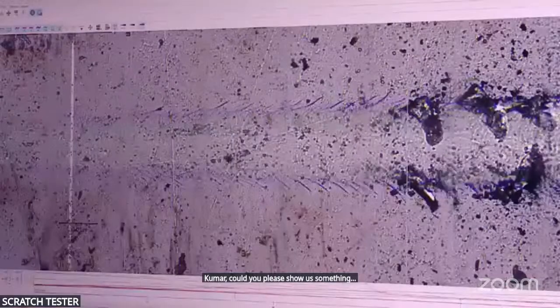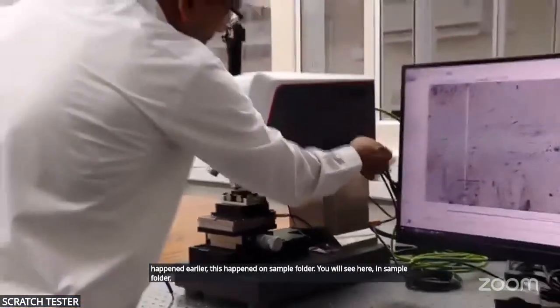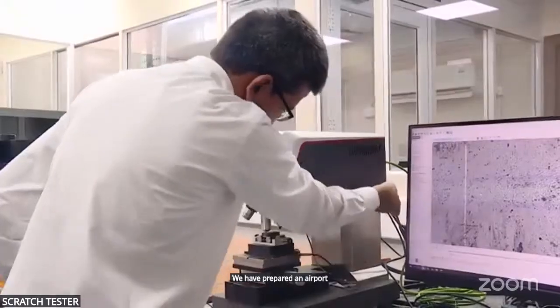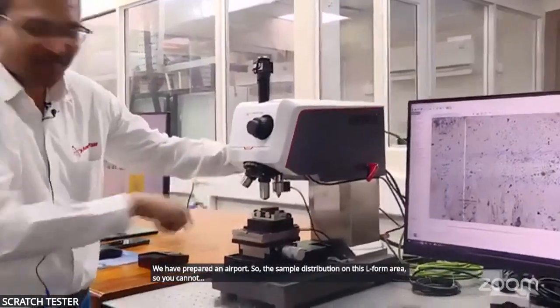Kumar, could you please show us the sample on the sample holder? Sure. You will see here in the sample holder, we have prepared an L form. So the sample will be positioned on this L form area, so the sample cannot move.